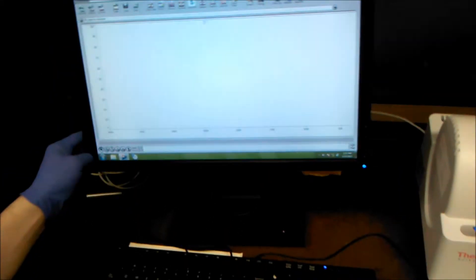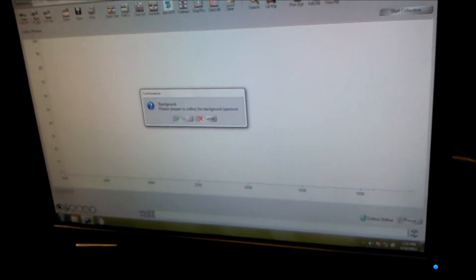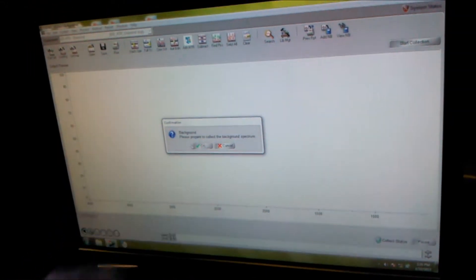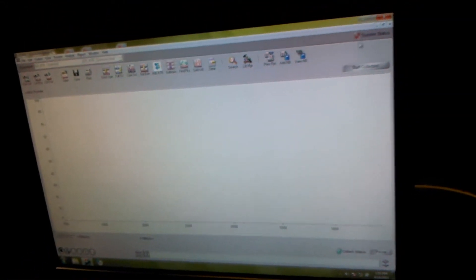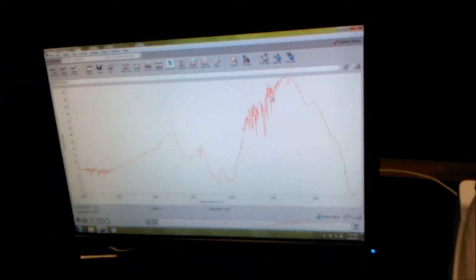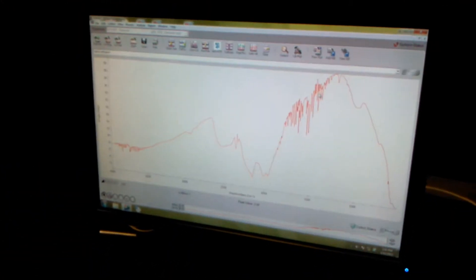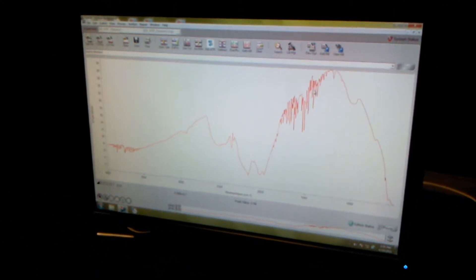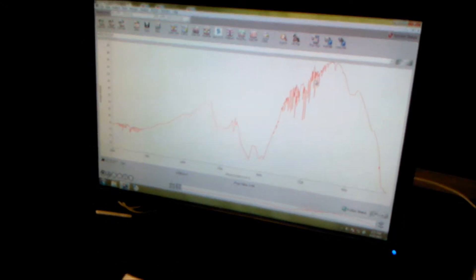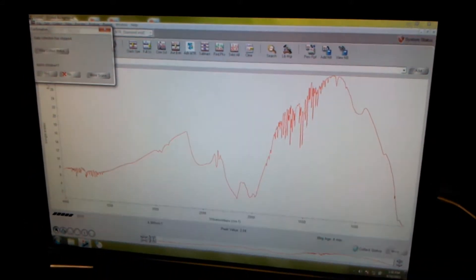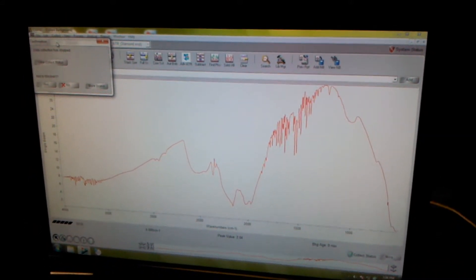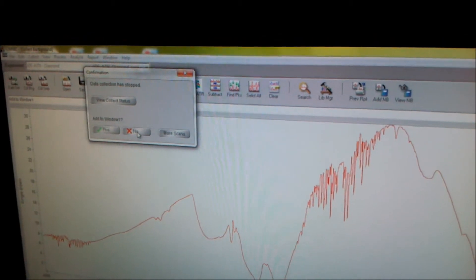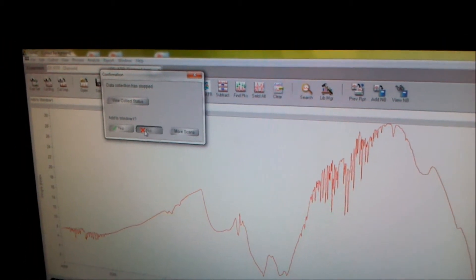The first thing we'll do is collect the background. Click on collect background, and then it says please prepare, we're OK, and then start collection. The machine's going to run 32 iterations, collecting the background, to make sure that it's not in with your sample. Once it stops, it's going to ask if you want to add the spectrum to the window. You do not want to add the background spectrum to the window, so click no.